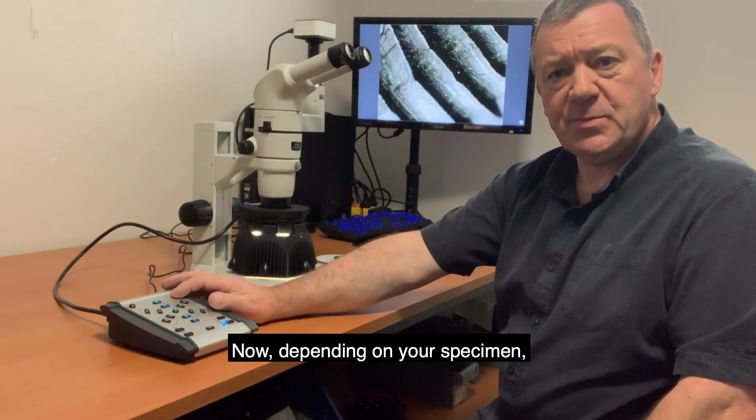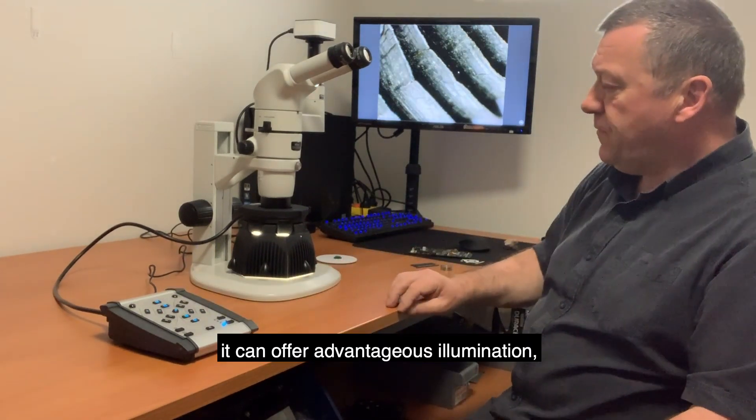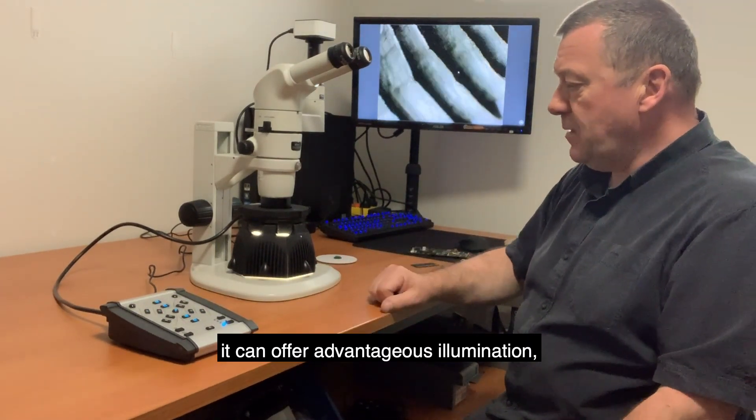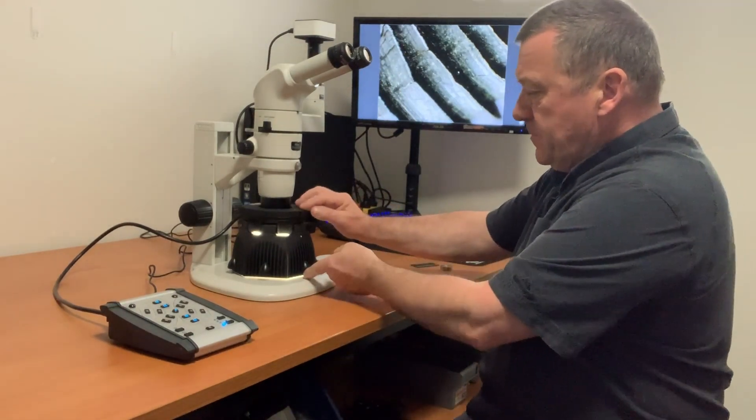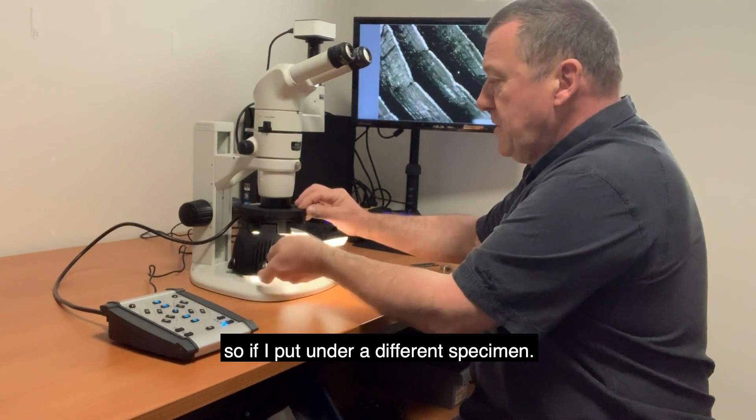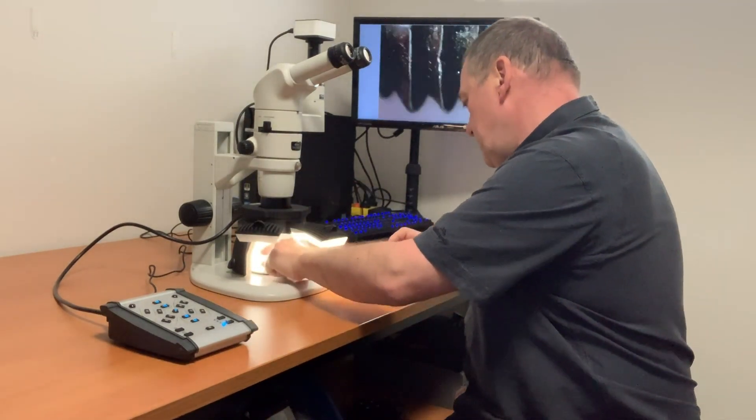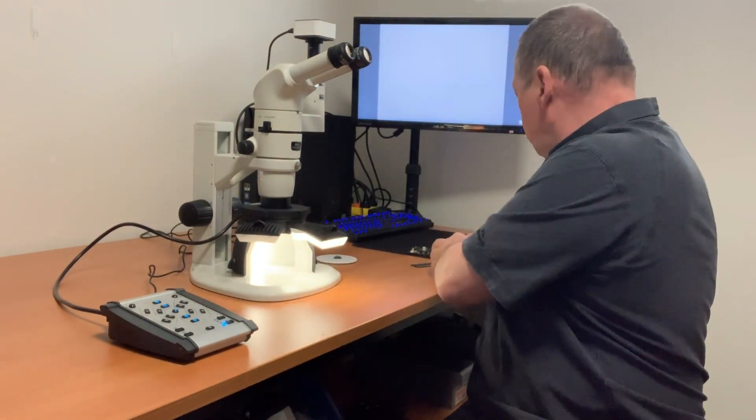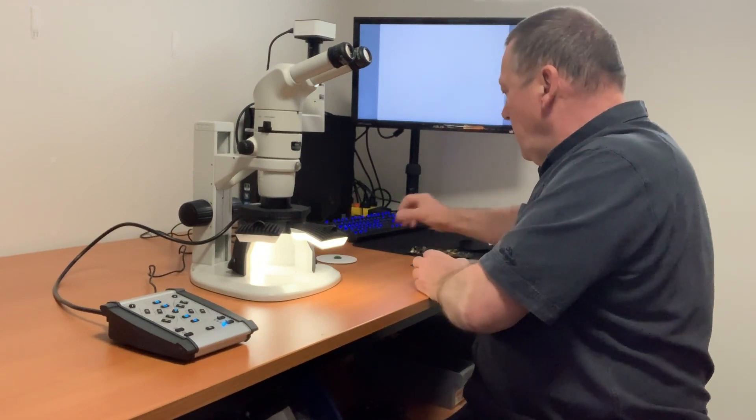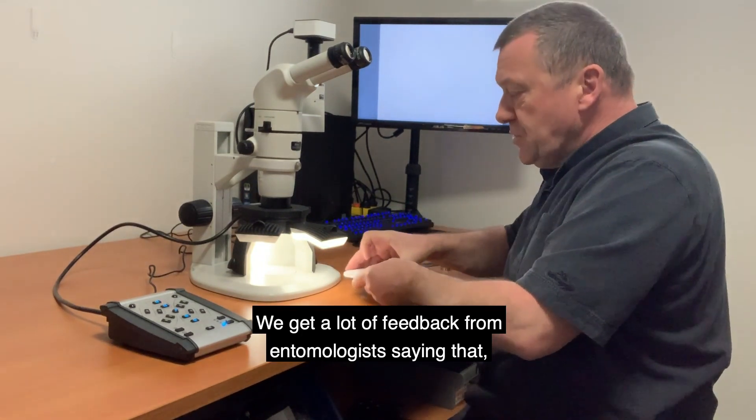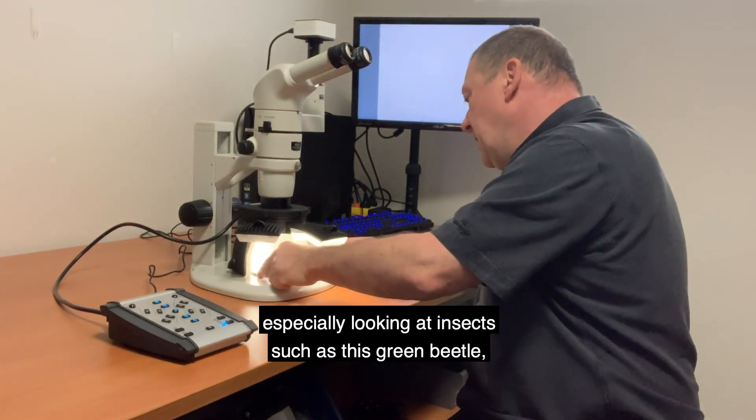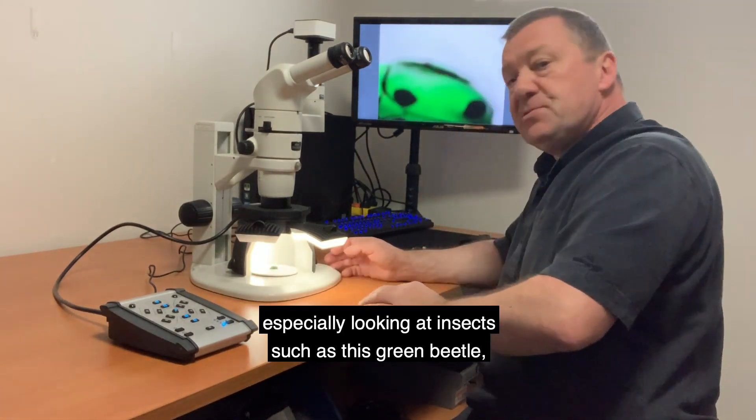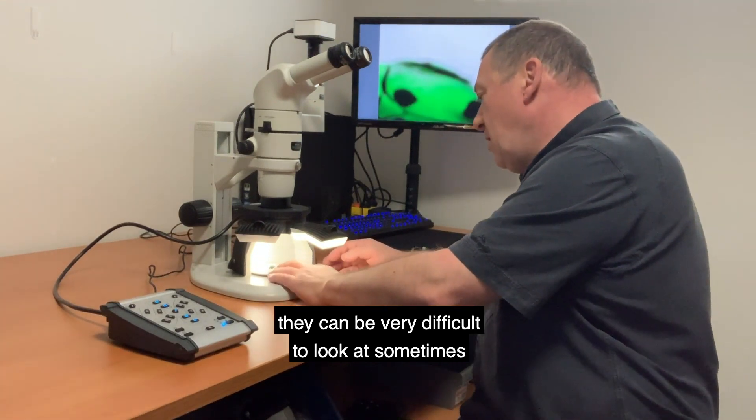Depending on your specimen, it can offer advantageous illumination. We get a lot of feedback from entomologists saying that especially when looking at insects such as this green beetle, they can be very difficult to look at sometimes with a conventional LED ring light.